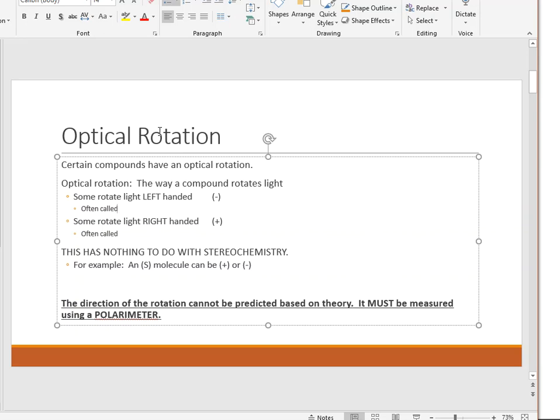So there's dextro-levo for the molecule, and then there's dextro-levo for the light and which way it turns, so I don't want you to get confused. So we're going to pretend like there is no name associated with the positive and the negative. All right, that keeps things simple for us at this time.